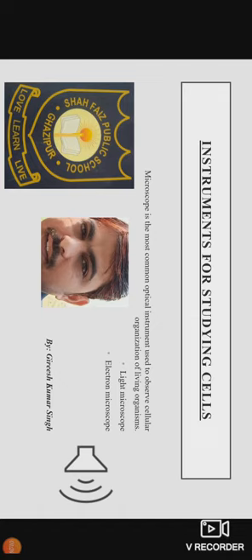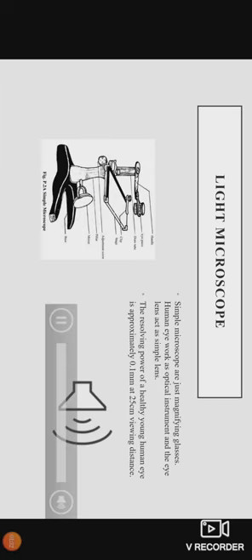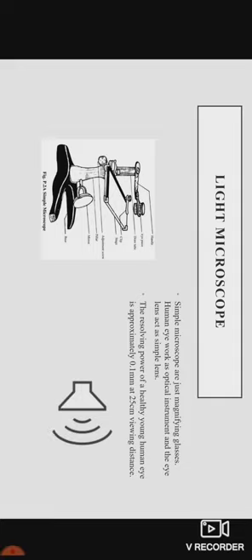In next slide, students, in this slide we will study about the light microscope. Dear all, it is commonly used in laboratory.